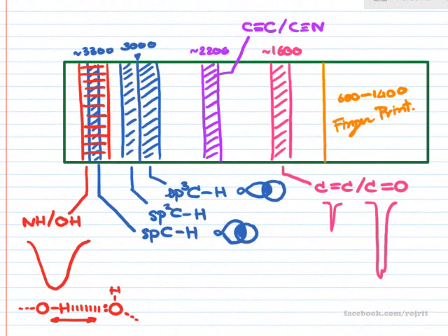So what I want to show you first of all is that on the left-hand side, around 3000, is the CH bond, because hydrogen is very light. Very light atoms vibrate very quickly, so it appears in the left-hand region, around 3000 something. It's CH bond, NH bond, OH bond, everything about hydrogen is on the left-hand side. But if you have CC bond, CN bond, CO bond, things like that, it depends. But anyway, it's around here.